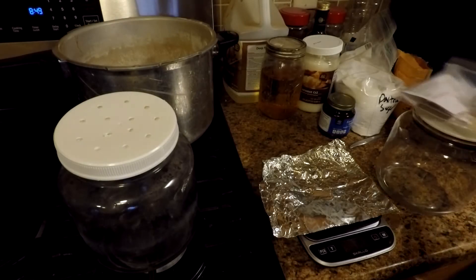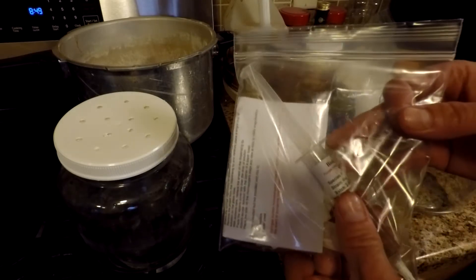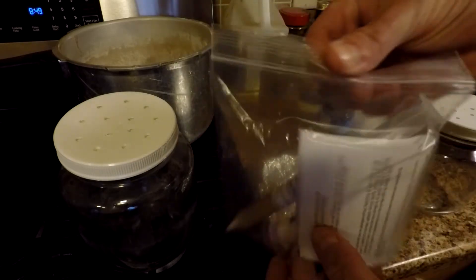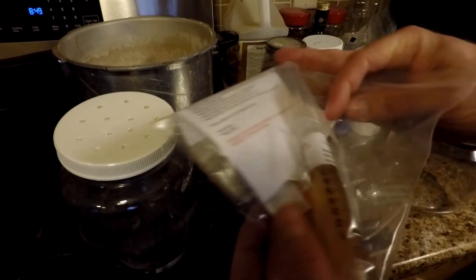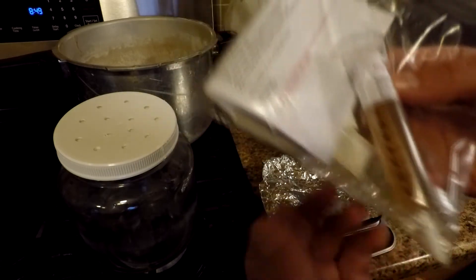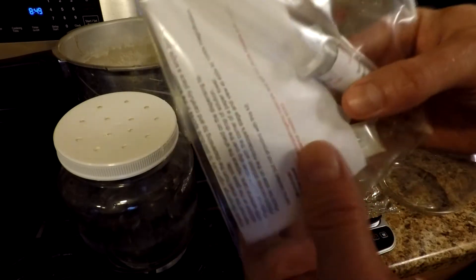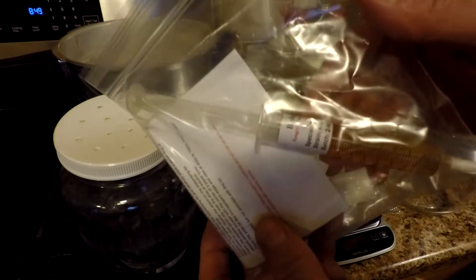Good morning everyone. I received my King Oyster culture syringe from Sporeworks yesterday. You can see it here — they package it nicely, all sanitary in the ziplock bag. It includes a fresh sterile needle tip, with a cap on there that you just unscrew and put the needle on in front of the flow hood. They also include a microscopy slide if you're a student who wants to look under the microscope to see the mycelium growing, or if you buy spores.